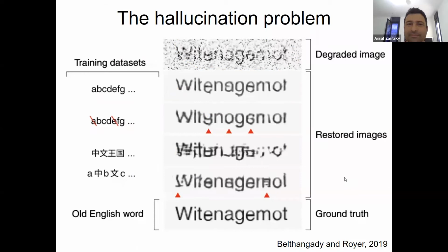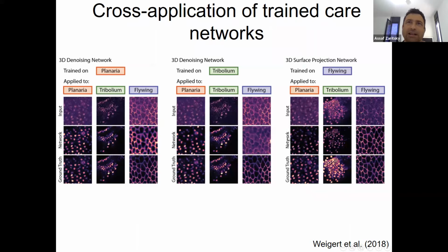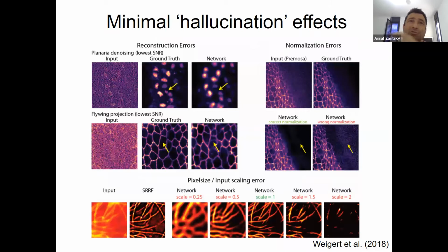So yeah. Are we supposed to generate training data each time? I guess there are tools that don't expect us to do that, right? Okay, so we are talking about generalization. Now you're asking about generalization. I talked about it a little bit here, right? Here you see that a model that was trained on one data set can be applied on another data set. I'm going to talk about it a little bit more. I just want to raise your attention to this issue. It's something that we need to be aware of.